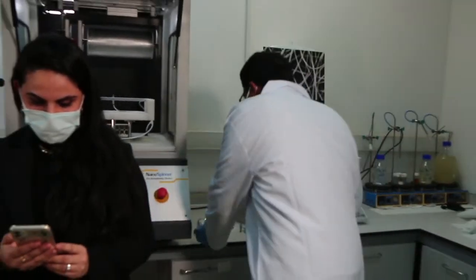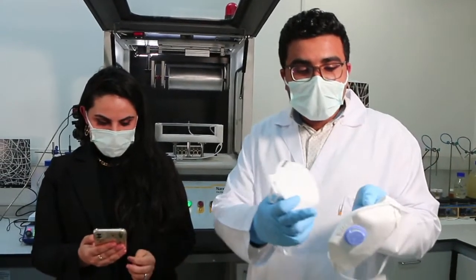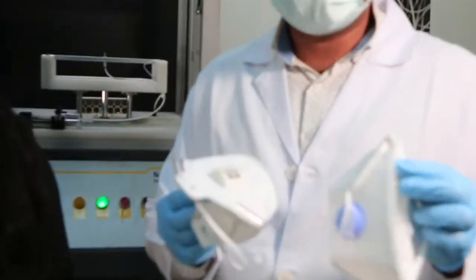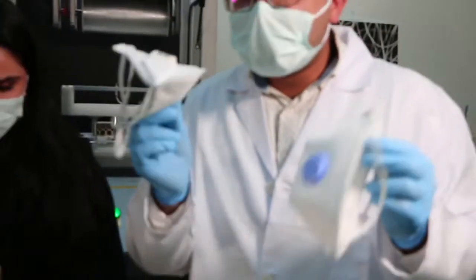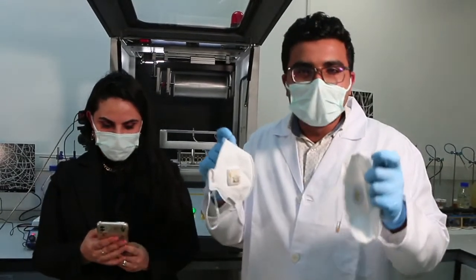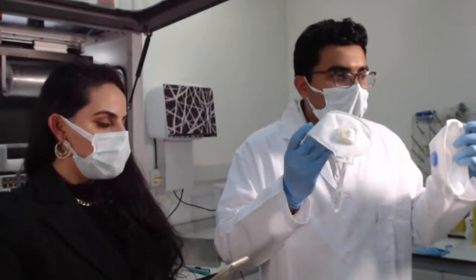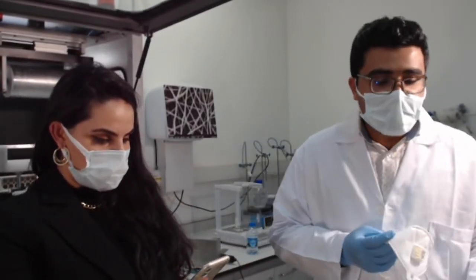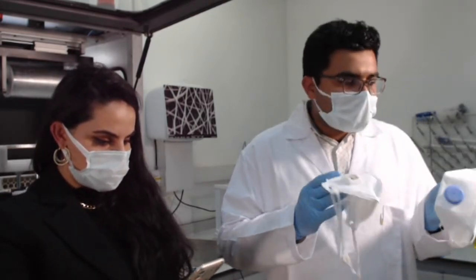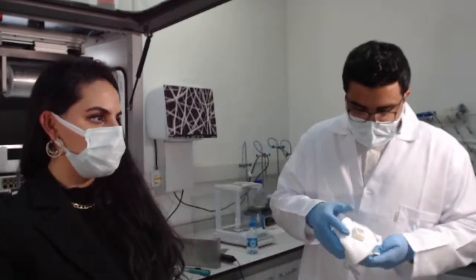And these are the N99, N95 masks. They're basically PET substrates, and inside these substrates you have your nanofiber layer. It's a very small nanofiber micron, about 0.6 or 0.8 GSM, and that is basically enough to incorporate high filtration efficiency while maintaining minimum pressure drop. The reason for polyethylene terephthalate is because we need a support layer onto the mask.